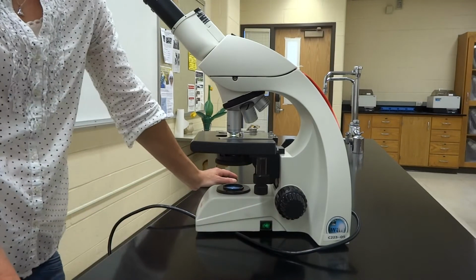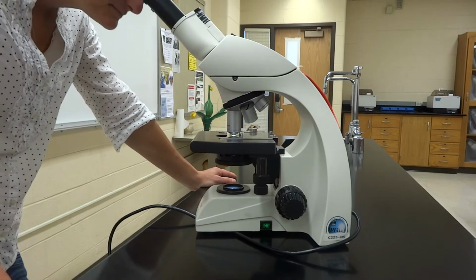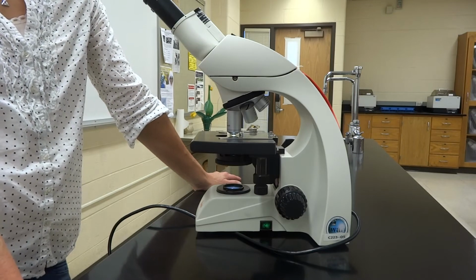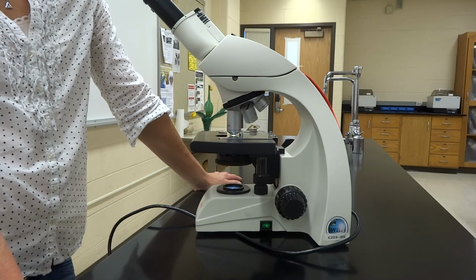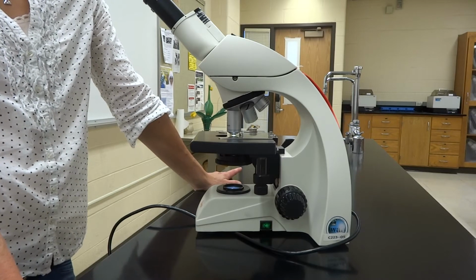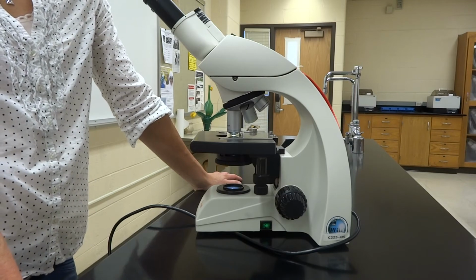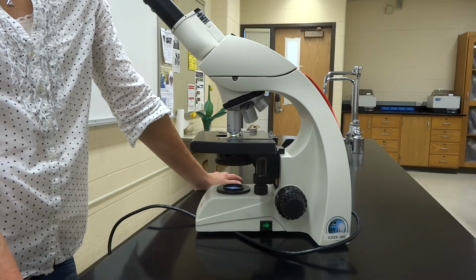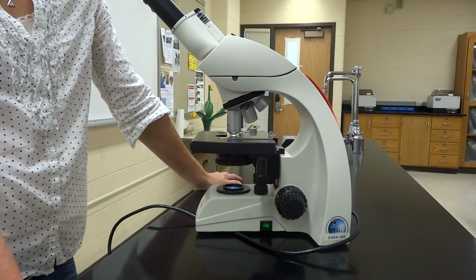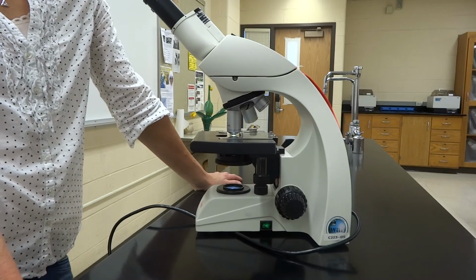So you will be able to turn the light a little bit brighter because as you move up with magnification, 3 things happen. Light decreases, the field of view decreases, and our depth of field will all decrease. So everything decreases as we move up with magnification. So once you've looked at your specimen, you should notice these things happen. And you will draw whatever it is you need to, because you should really draw them all. Better memory, right?